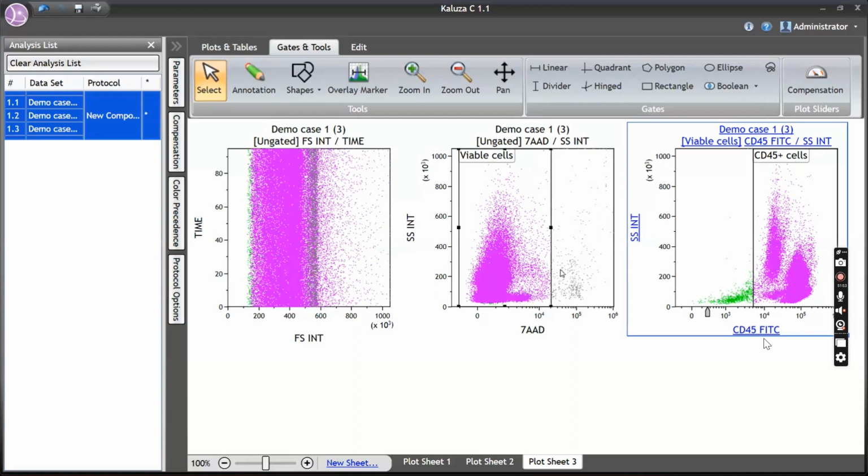Now you tell me the reason why we are removing this, because these particular cells here, CD45 negative, could be anything. It could be a platelet. It could be an RBC fragment. Getting my point? And they can show a non-specific CD34 positivity.